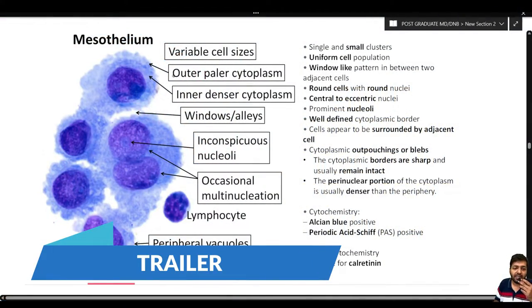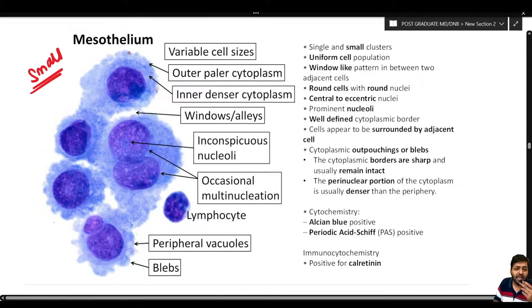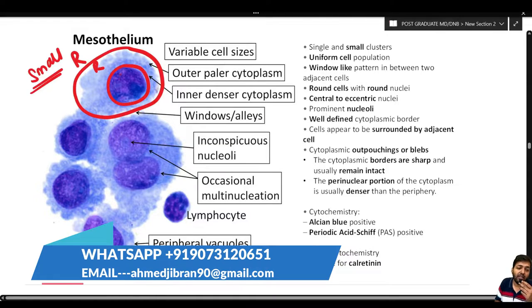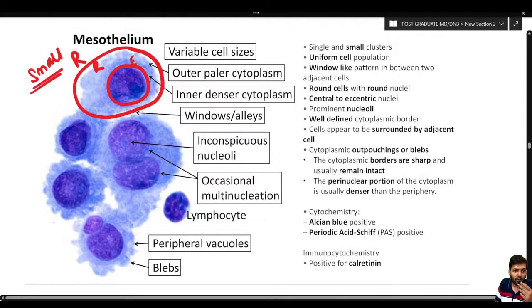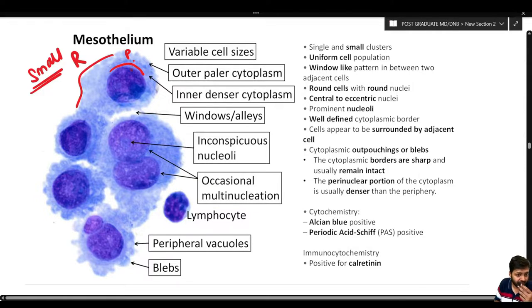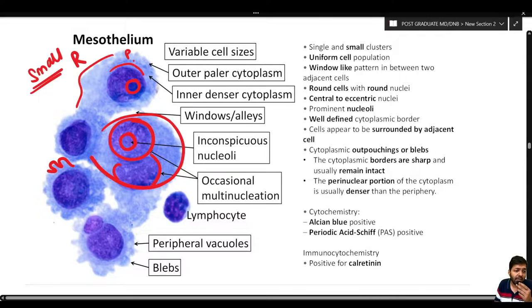These are the characteristic mesothelial cells present in small clusters. If you see an individual mesothelial cell, they are round and the nucleus is also round, with the nucleus central to eccentrically placed — shifted to one side. The cytoplasmic border is quite sharply defined, and the perinuclear cytoplasm is quite dense compared to the outer pale cytoplasm.